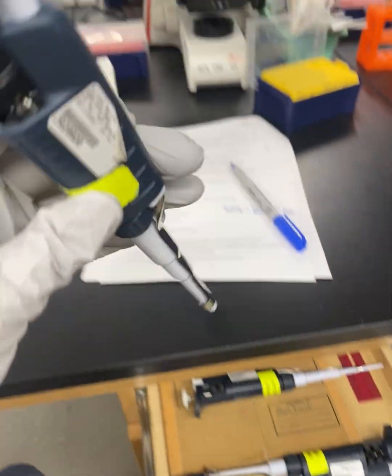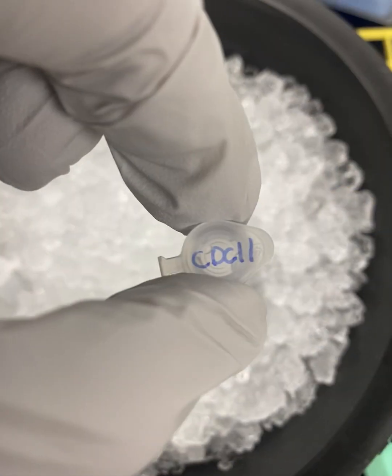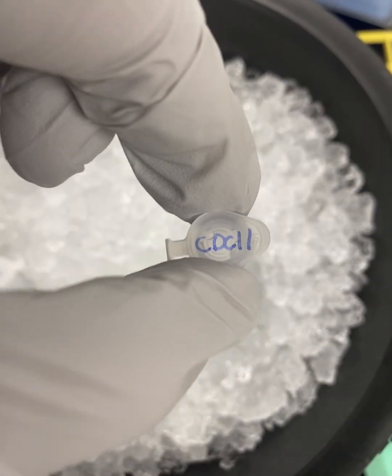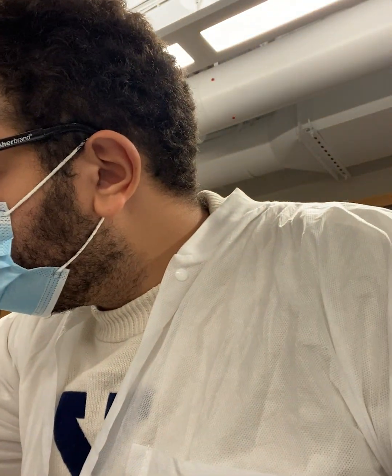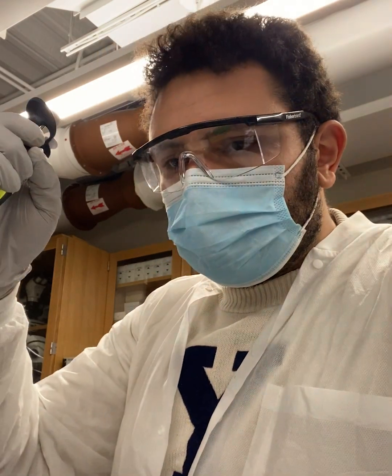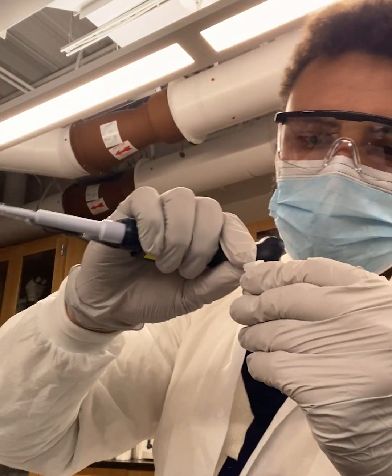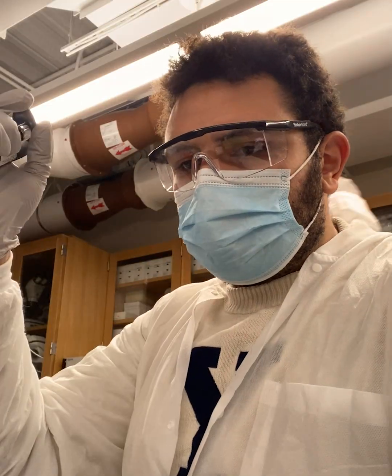I was given the plasmid that encodes the gene CDC11. Others in the class received one of the other three plasmids. Together, we would be able to see whose plasmid was successful by mixing the competent CDCX cells, that is, the cells that have been chemically treated to increase DNA uptake, with our plasmid and incubating them with the lithium acetate SS-DNA PEG transformation mix, called solution 3 in our handout.